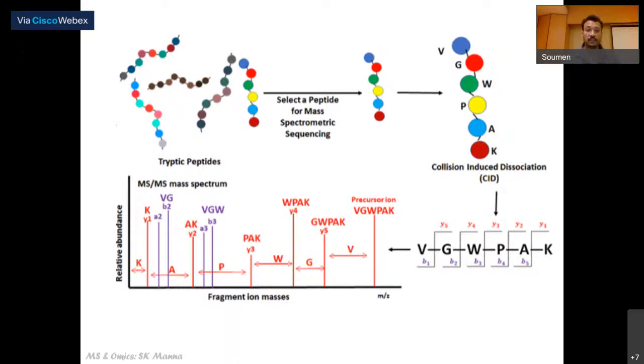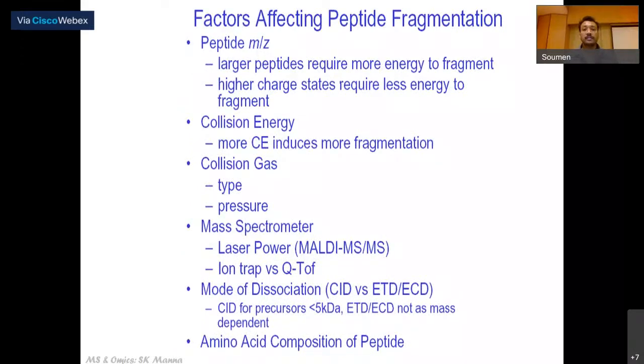this exercise. So while talking about fragmentation, because a lot of whatever you are doing in proteomics, including identification of the peptide sequence and the peptide identity, getting the modification, etc., everything depends on what kind of fragments you get. Because the overall mass of the peptide will not give you any sequence. The sequence will come from the fact of how they are connected to each other, in which sequence, in which pattern. And what are the side chains, etc.